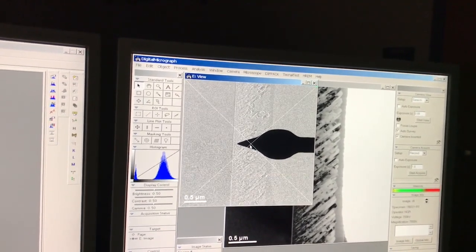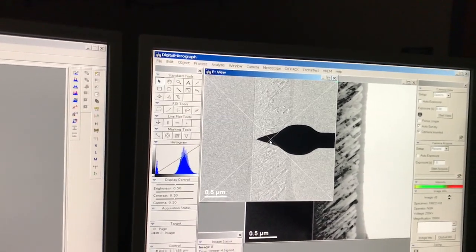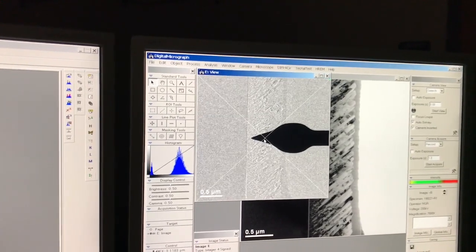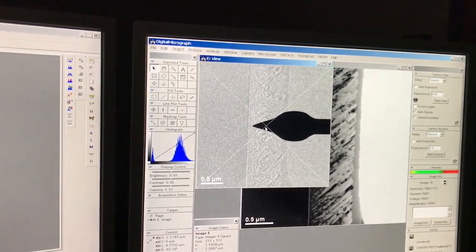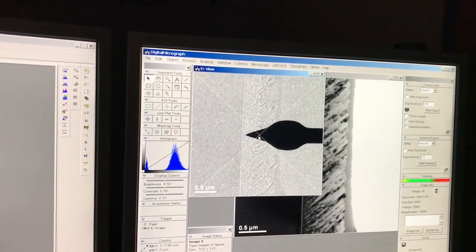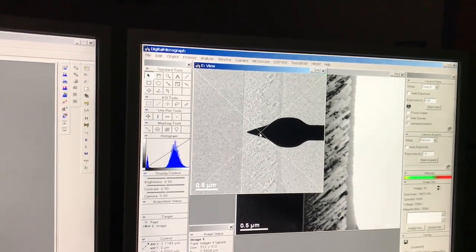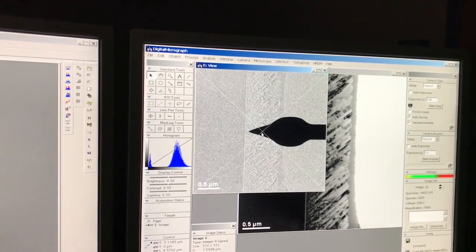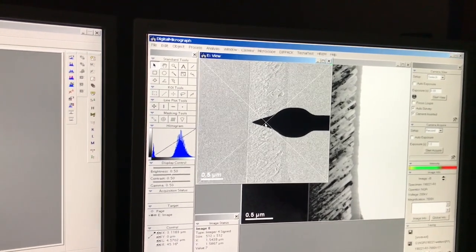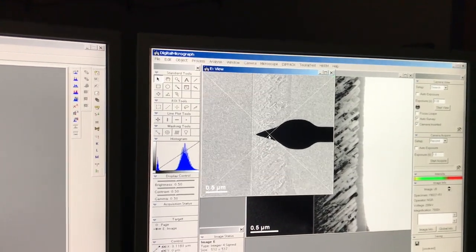What am I going to do now that I have that? So that's going to block the direct beam. The direct beam is the most likely thing to cause damage to your camera scintillator. Okay, and that's usually not what you're interested in anyway when you're recording a selected area pattern. You don't care about the direct beam, you care about the other stuff. Okay, so you really don't want to see that because it may just swamp out everything else, and then you also run a risk of maybe damaging the camera. So we deliberately block it off.